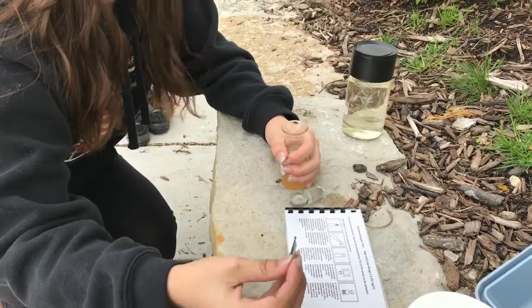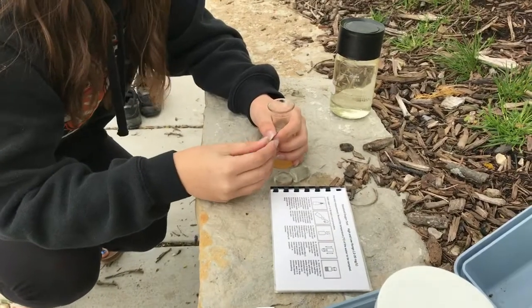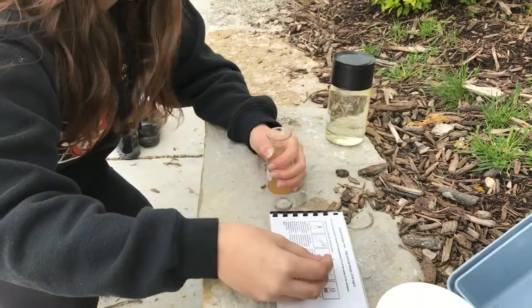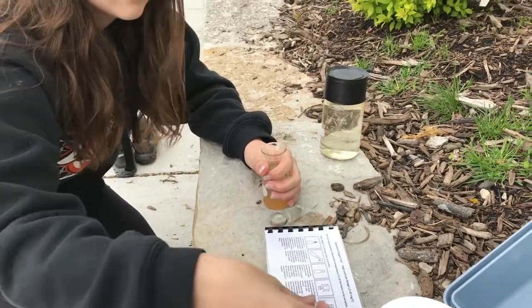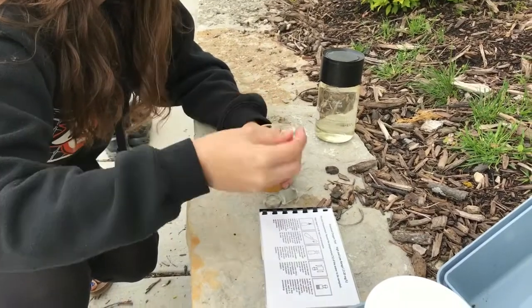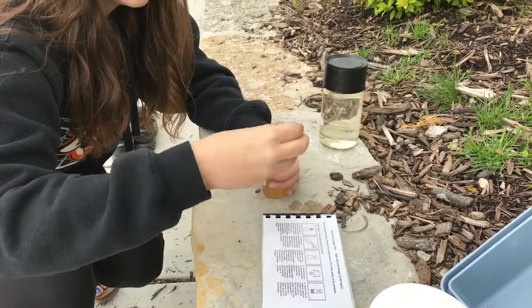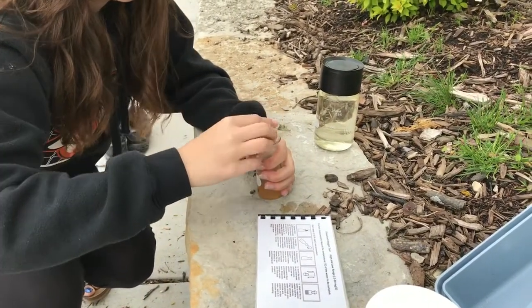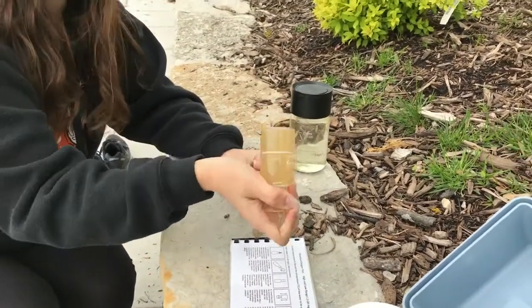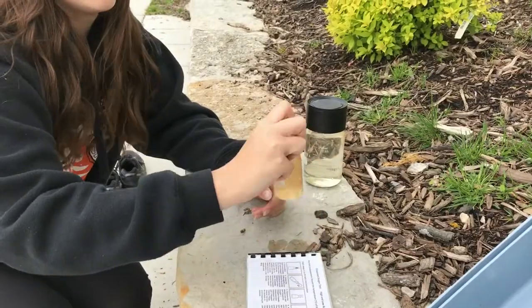The next step is to open chemical packets number one and number two and pour them gently into the flask. After both chemicals are emptied in, you'll want to take the cover, place it on top of the flask, and invert it repeatedly until it turns an orangish yellow precipitate, as shown inside the flask.